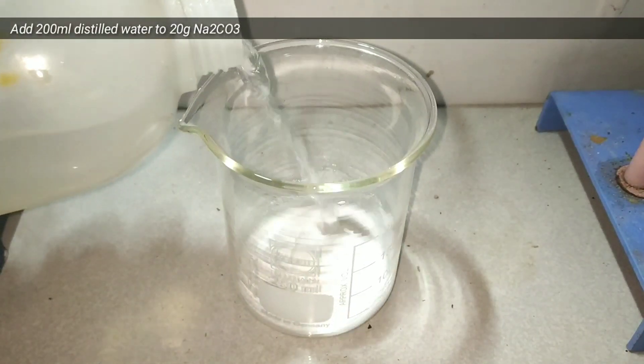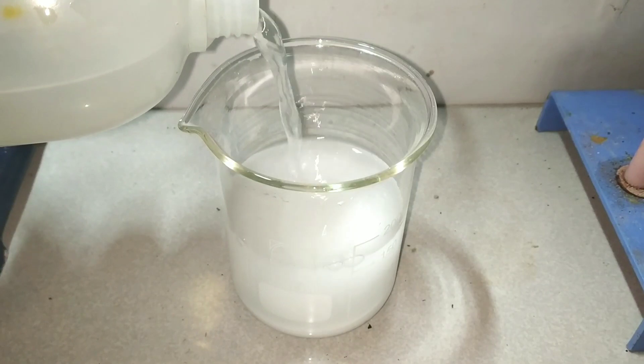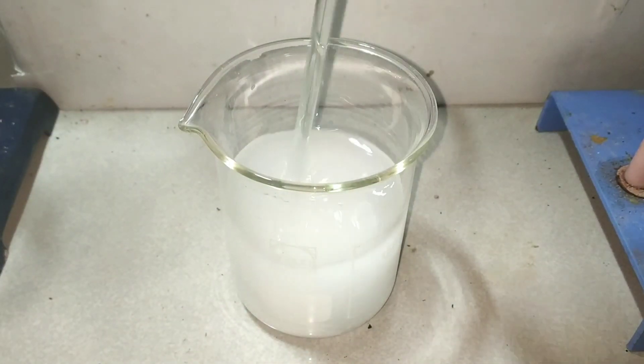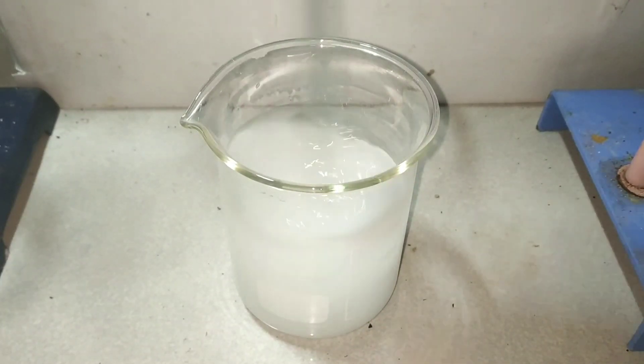Next we take the pre-weighed 20 grams of sodium carbonate in a 250 milliliter beaker and add 200 milliliters of water into it. Then we mix it well with the help of a glass stirring rod to make a solution.